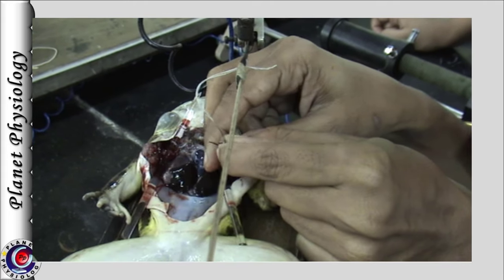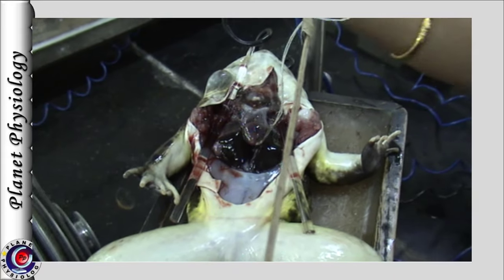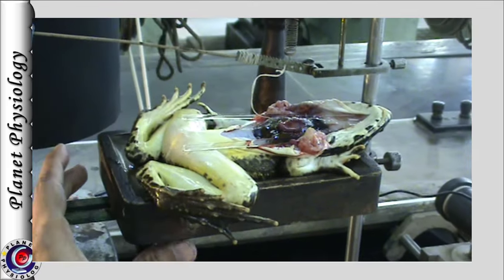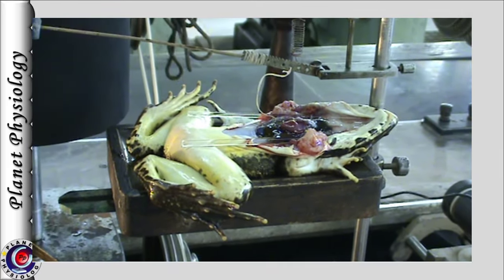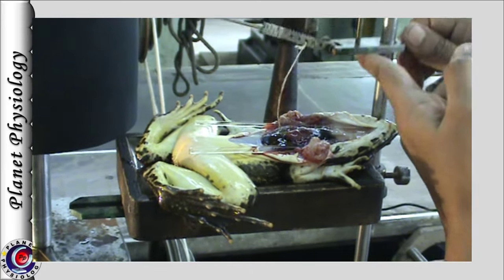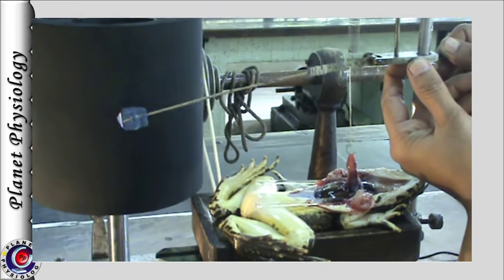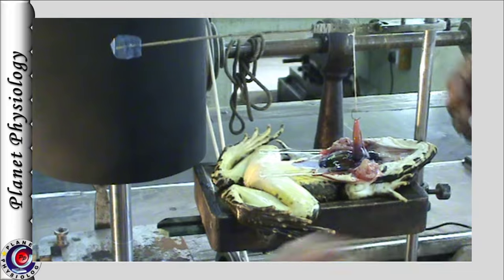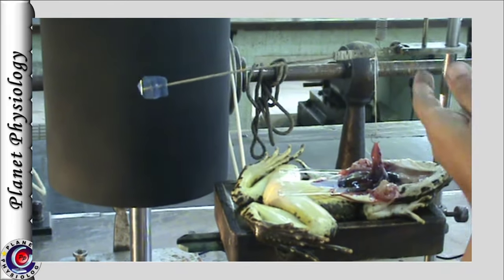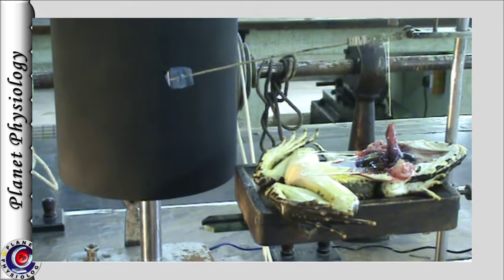We frequently pour a small amount of normal saline or Ringer's solution to prevent the preparation from drying. It also maintains ionic balance and the tissue works for longer duration. Now the lever is elevated till the heart becomes vertical, making sure it does not exert any undue tension on the heart. At this position, if the longer arm of the lever is inclined, then the spring tension is adjusted to make the lever perfectly horizontal.